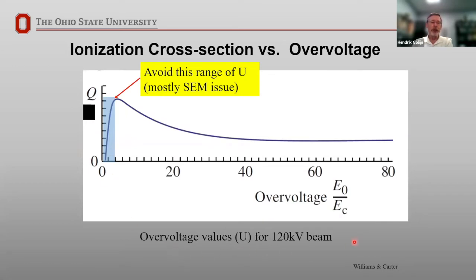So this is showing like 120 kV. But if you think of a 200 kV electron and a 10 kV ionization energy, which is roughly where copper is, it's at 9, you're already operating at an overvoltage of 20. So you don't have to worry about that so much when you're doing TEM or STEM EDX analysis.